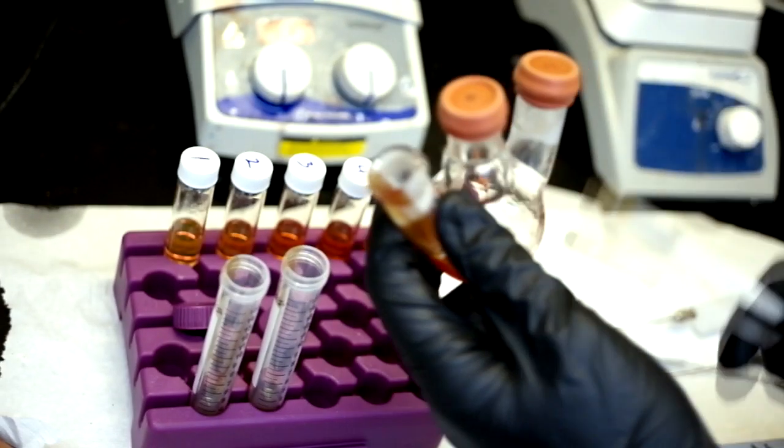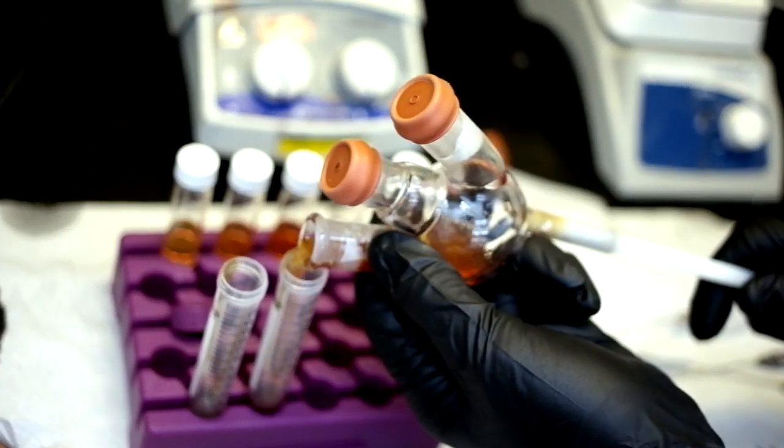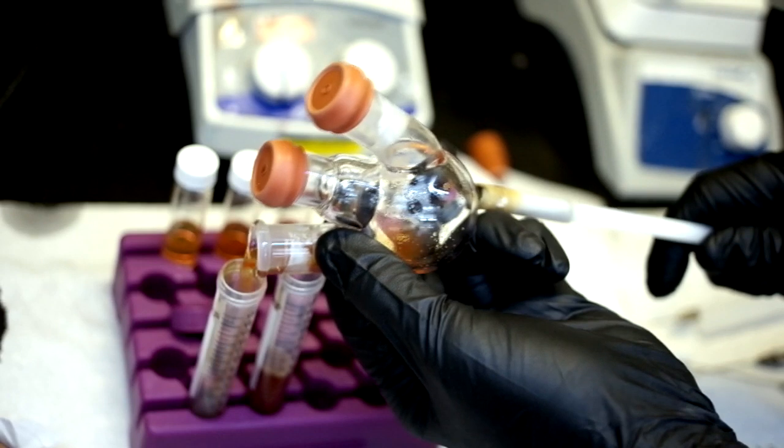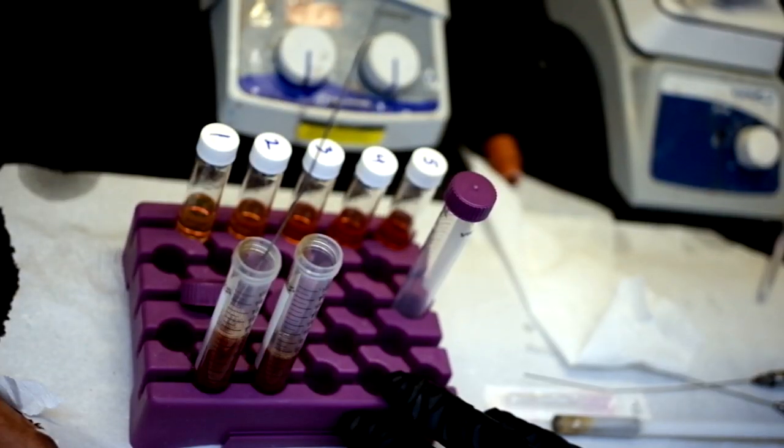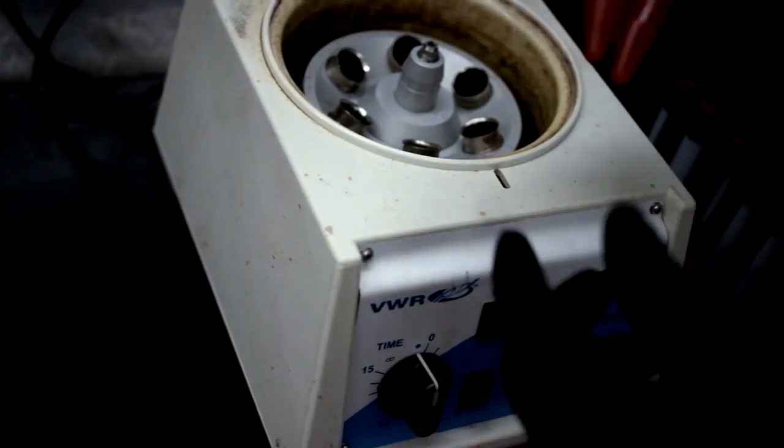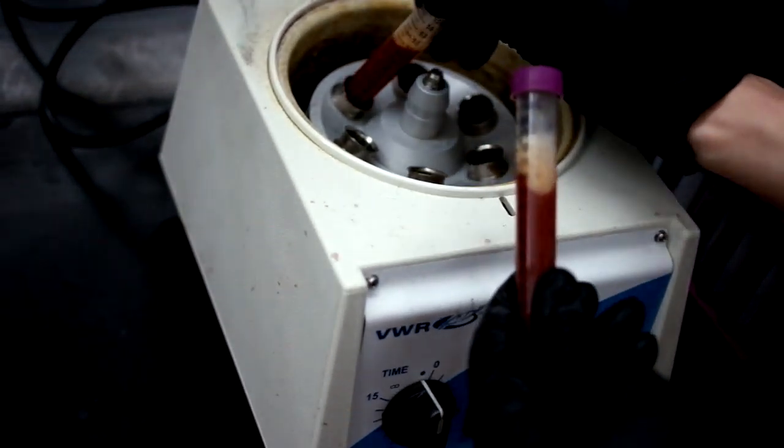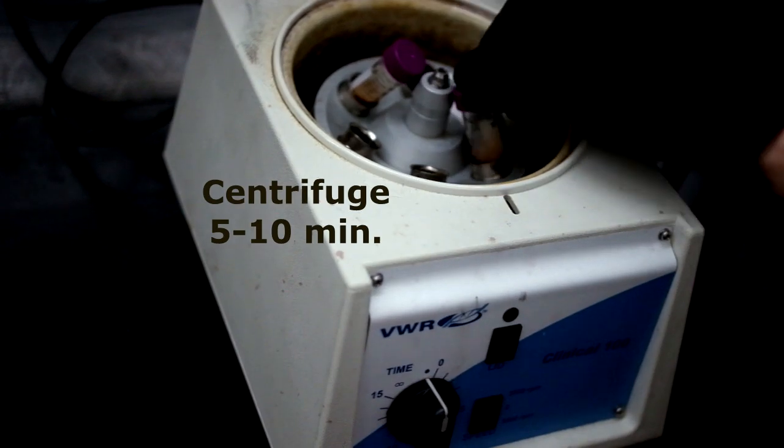Use the magnetic wand to ensure that your magnetic stir bar does not fall into your test tubes. Continue adding chloroform until you have an equal volume in each test tube. Shake the test tube to ensure the material is mixed well and centrifuge for several minutes.